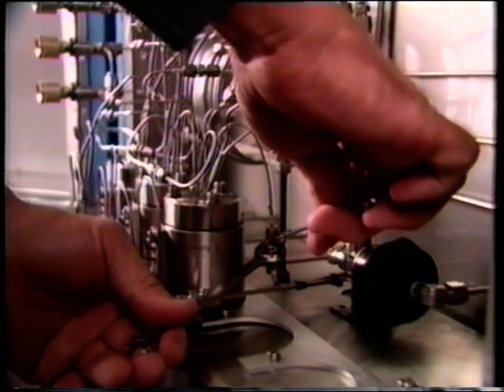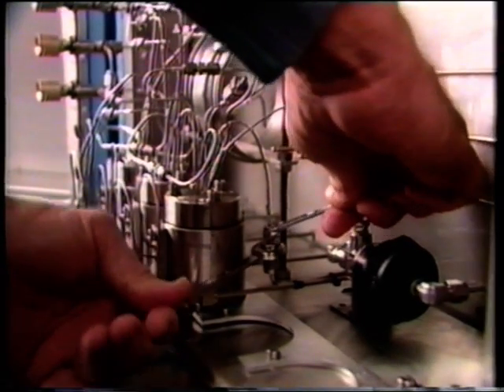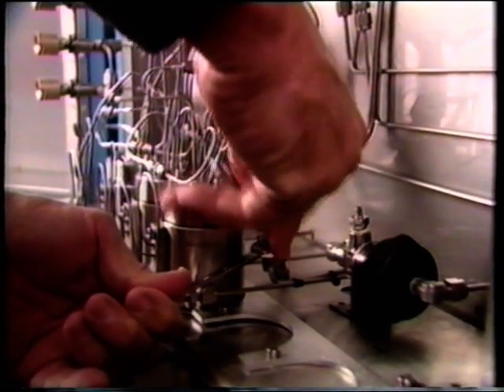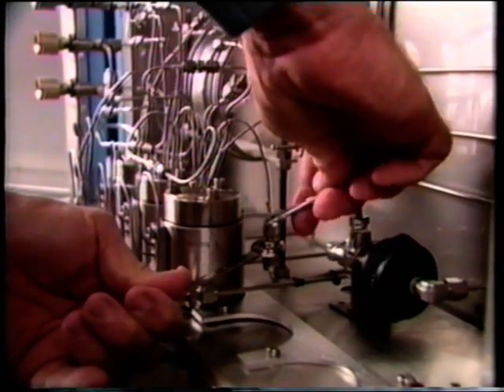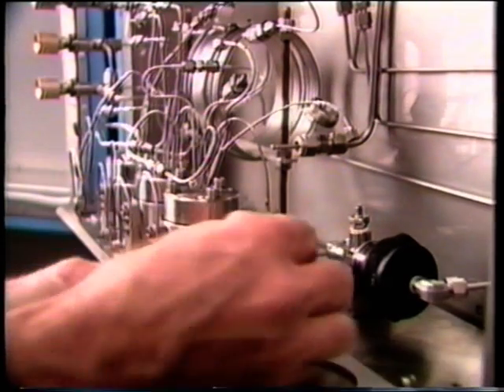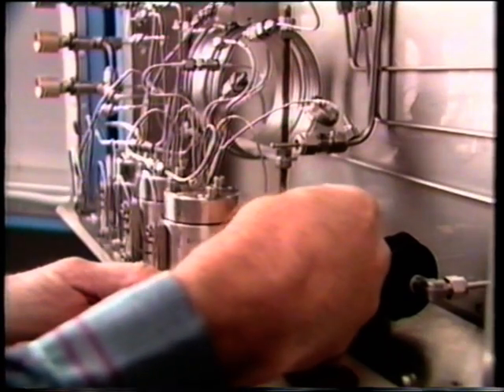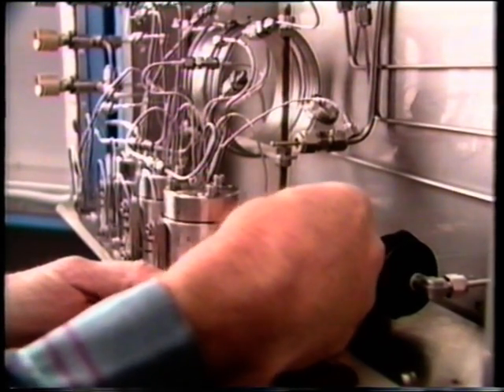Valve leakage often occurs from the carrier port to the sample port, since the carrier pressure is often higher than sample pressure. Since this process is neither toxic nor corrosive, protective gloves are not required. Consult your facility guidelines for injection valve maintenance.